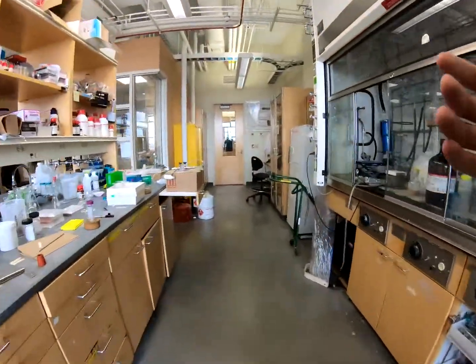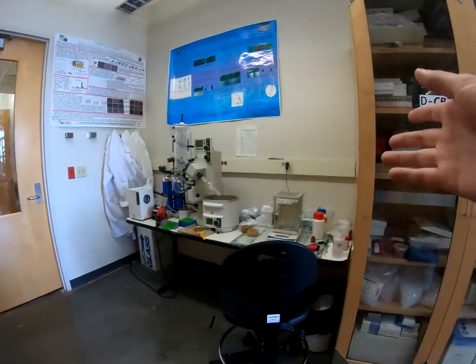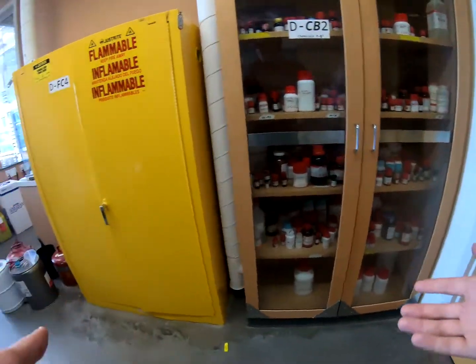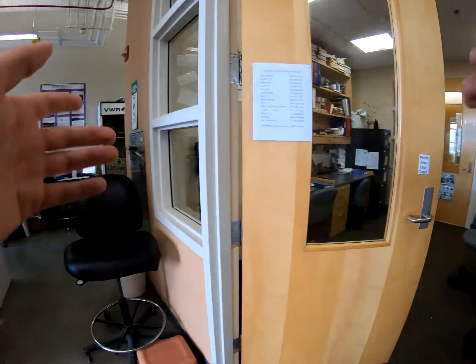The last thing that we have to talk about in Lab D is in the corner over here, where we've got one of our rotovaps and a balance, as well as some more chemical storage. All right, and that leaves us finishing up all of the instrumentation in the actual lab space.